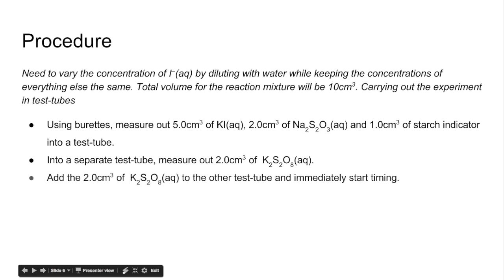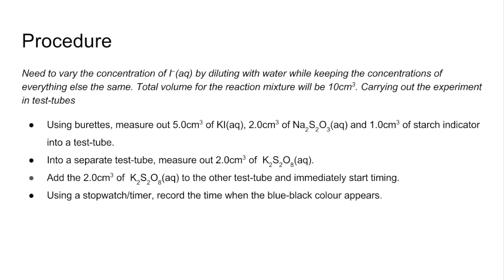When we're ready, we're going to add the 2 cm³ solution to the other test tube and immediately start timing. Using the stopwatch, we're recording the time for the blue-black color to appear, as you saw in that little video.